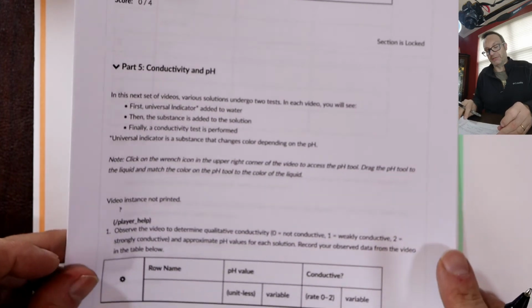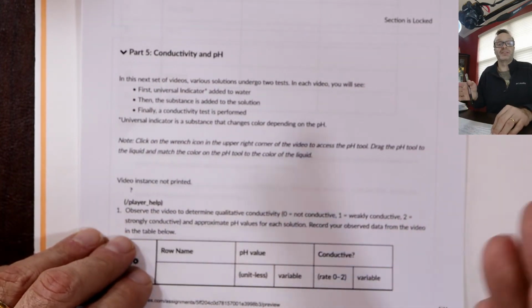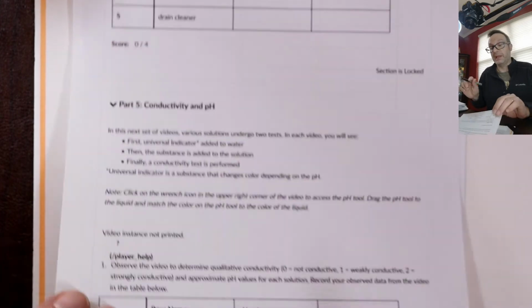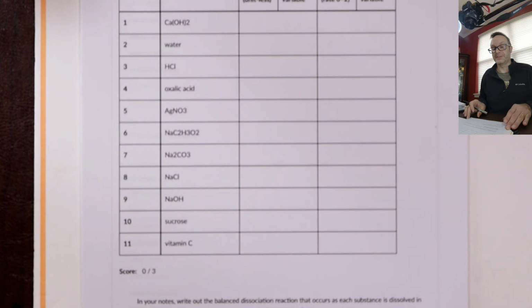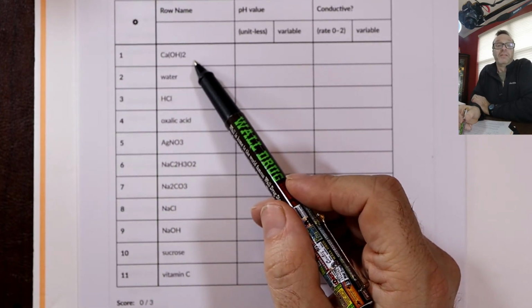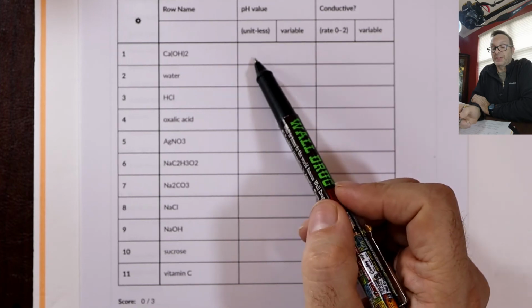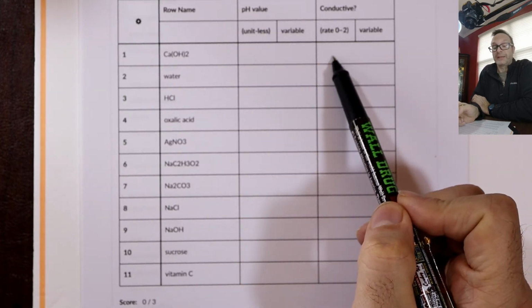Conductivity and pH: the relationship is that more ions in solution means higher conductivity, and if it's acidic you get a lower pH, or if it's basic, a higher pH. There's your solutions. Now let's just do a couple at random. Calcium hydroxide is very basic, right? It's a strong base, so we should see a super high pH, and it should be quite conductive.